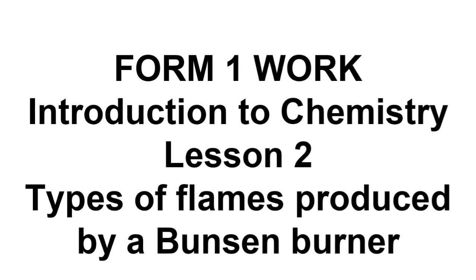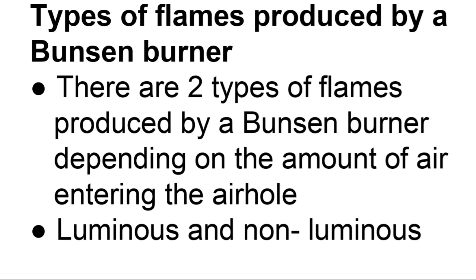Welcome to our today's lesson. It's on Form 1 work, Introduction to Chemistry, Lesson 2, by Teacher Mercy. The topic of our today's lesson is types of flames produced by a Bunsen burner.